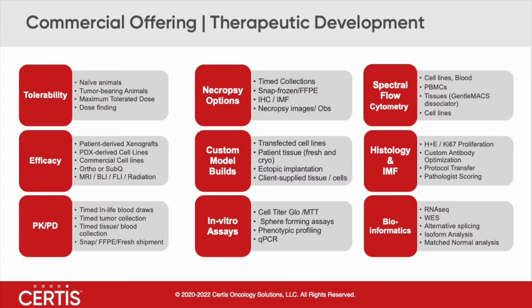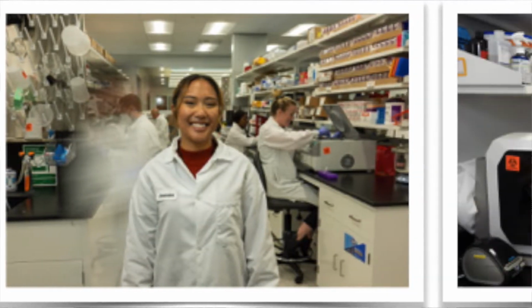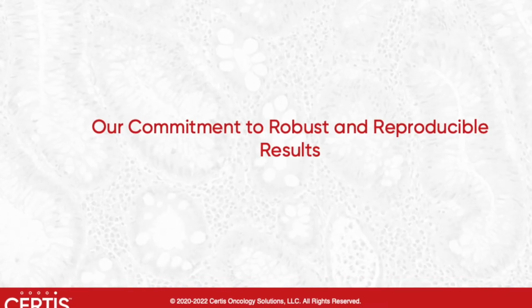My name's Bridget Corcoran. I'm the in vitro manager here at Certis Oncology. I specialize in PDX tissue culture techniques, mostly 96 well, 384 well plate assays, including MSD, flow cytometry, IHC, PCR, Western blotting, and ELISAs. We have a really great, fabulous team here at Certis.